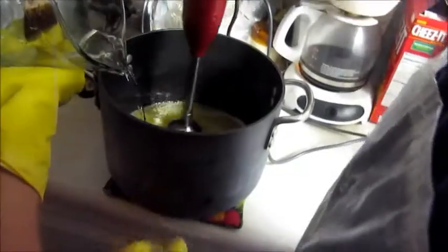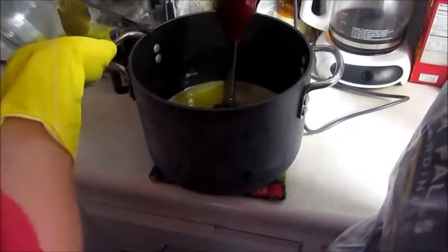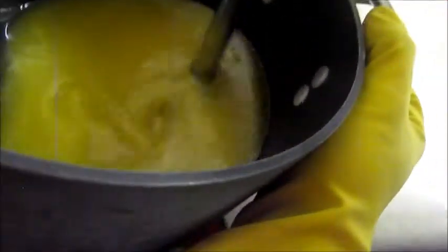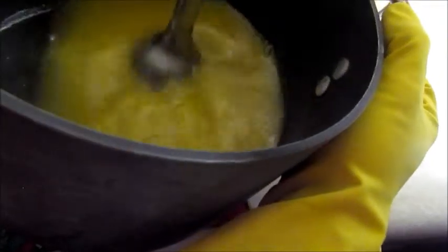Once the lye water has cooled to 100 to 110 degrees, slowly pour it into the oils. Be sure that the oils are not hotter than the lye. Begin mixing with a stick blender on low setting and then turn up to a higher setting, making sure the solution is thoroughly mixed. When the solution begins trace or a yogurt consistency, add the peppermint essential oil. Be sure to mix well.